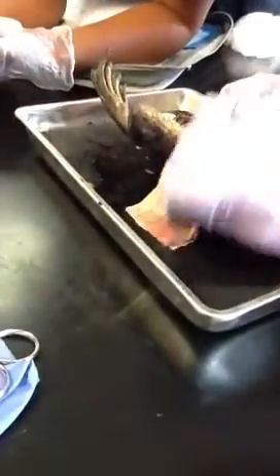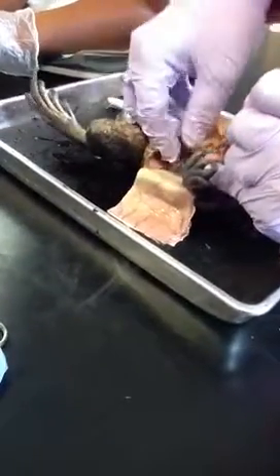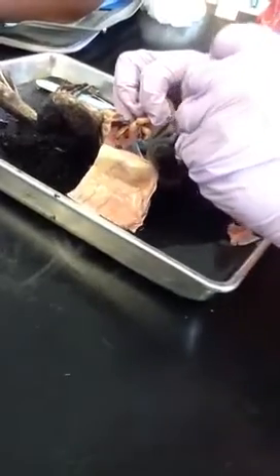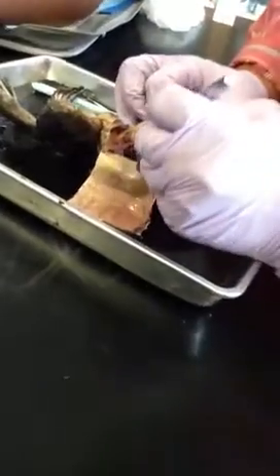Just tear the tissue away. And there is her right kidney. And more eggs, with the oviducts. Have to move those out of the way. Eggs everywhere. She was packed. Are all the females like that? Oh no, it just depends on what part of the reproductive cycle they're in as to how many eggs they have in their abdominal cavity at one time. So she was probably about ready to release them.